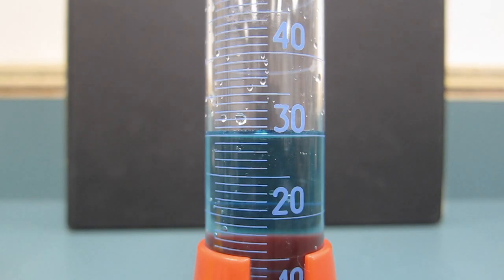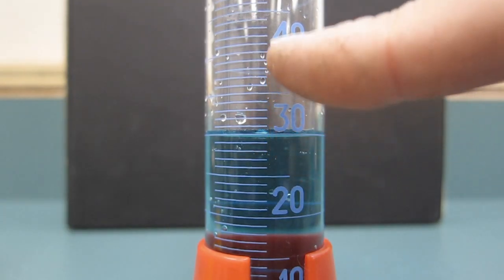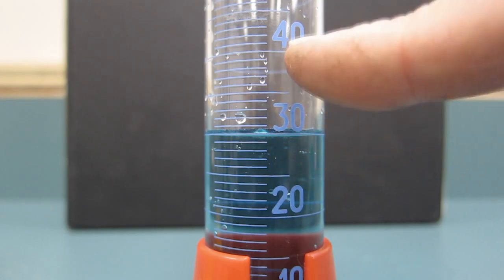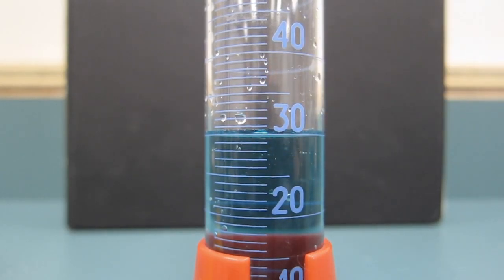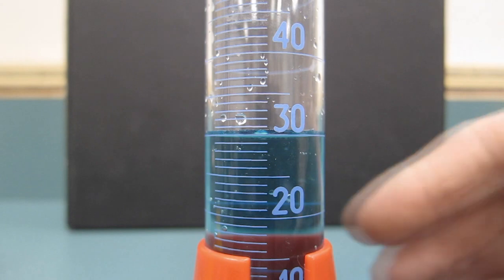So if I need to get 31, I'd go one more tick mark above there. By the way, I know I'm counting by 1s on this scale because there's a difference of 10 divided by 10 tick marks means a scale of 1. So that'd be about 30 milliliters.